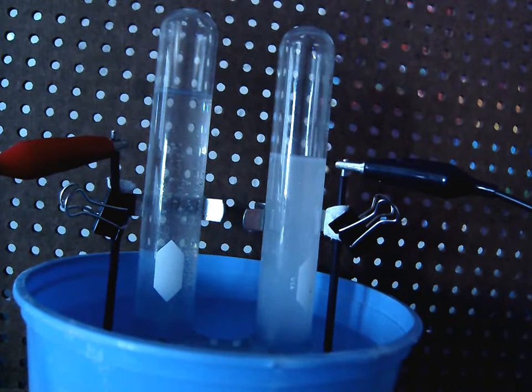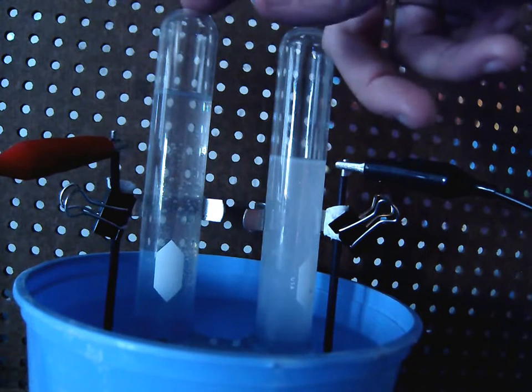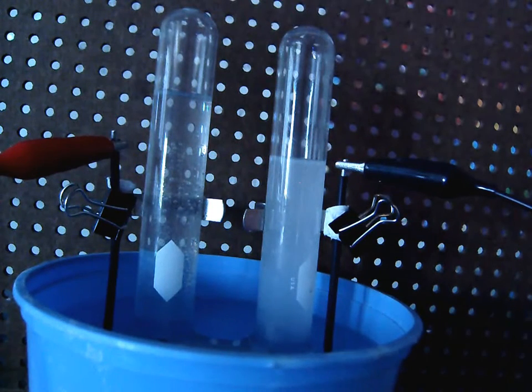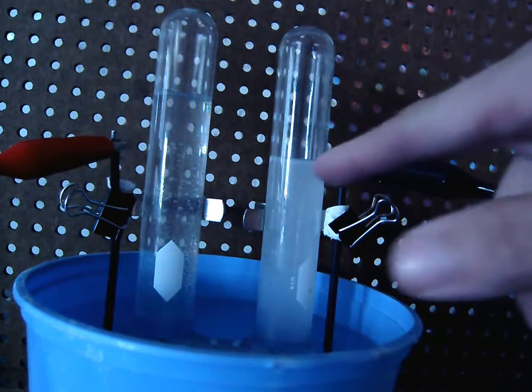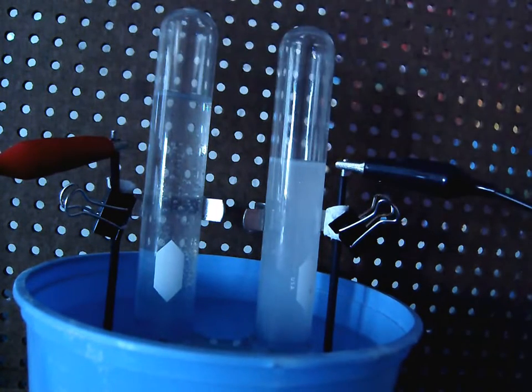In this case, I'm just going to cut to the chase and tell you, because I know how this works, that the test tube on the right is the one that's collecting the hydrogen, and the test tube on the left is the one that's collecting the oxygen. So then, again, like I said before, we would measure how much hydrogen was produced, we'd measure how much oxygen was produced, and we would compare those two.